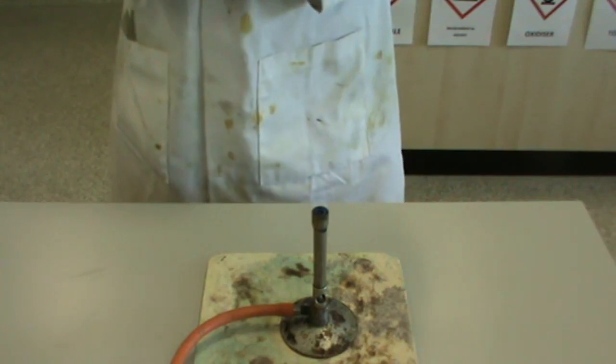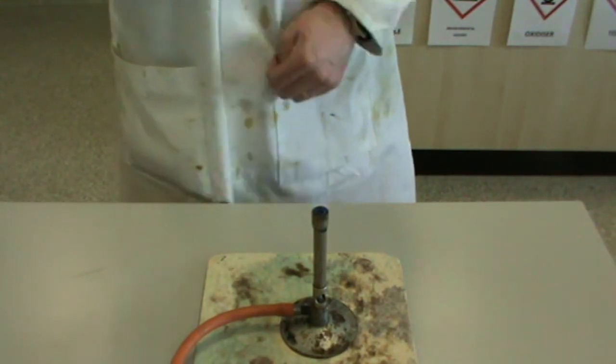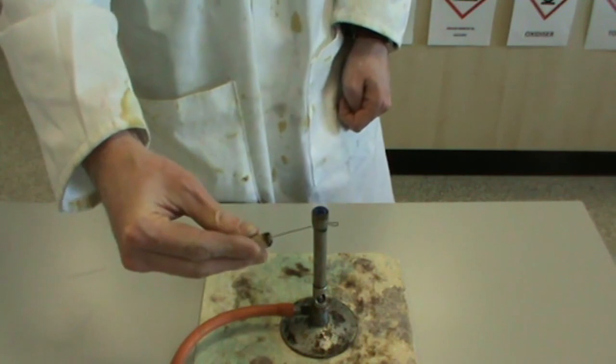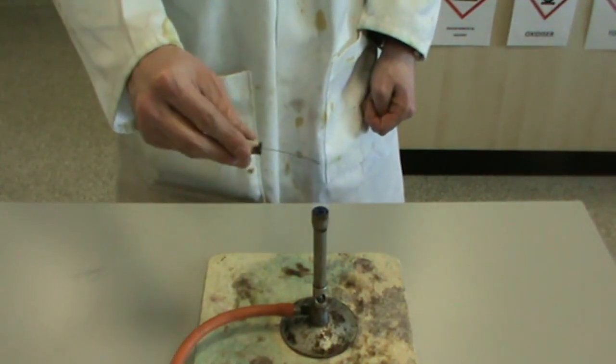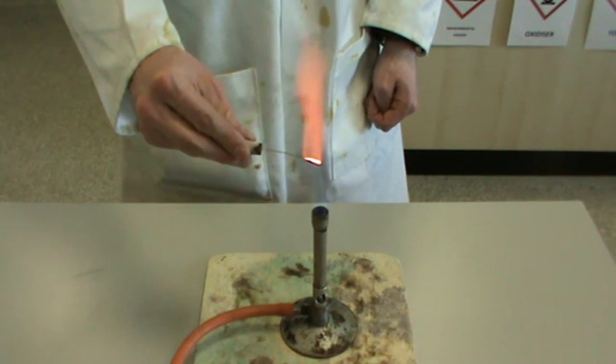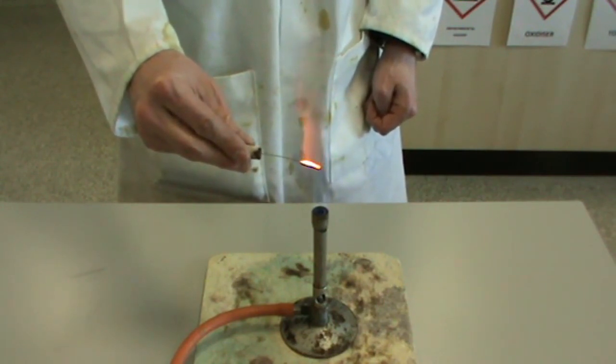To carry out the flame tests of a solution, you first of all need a metal loop and we need to make sure that there aren't any traces of any metal ions still present on there. To remove that, we will heat the loop until the flame goes clear.